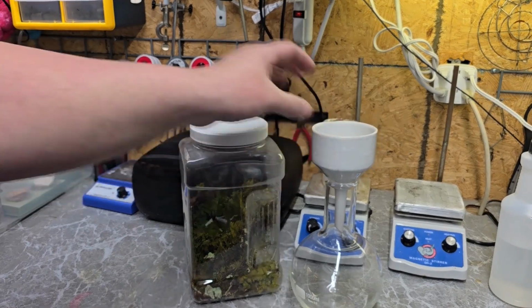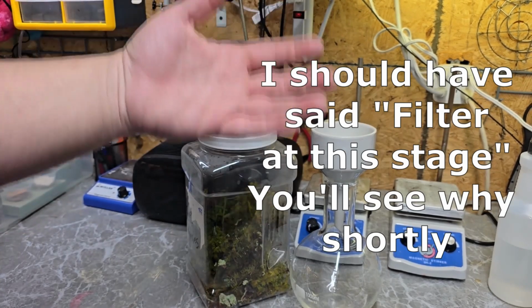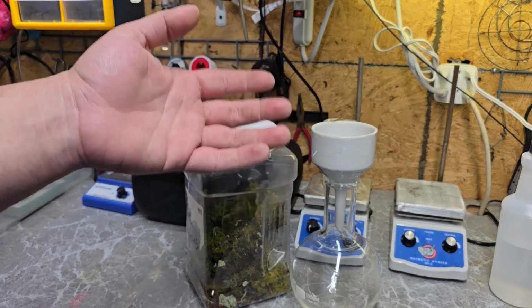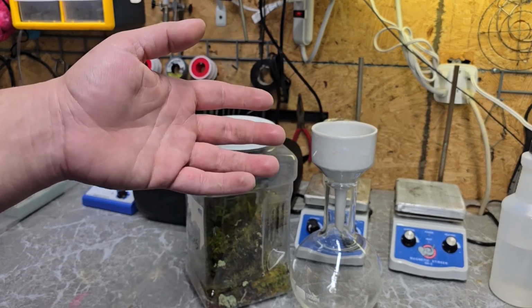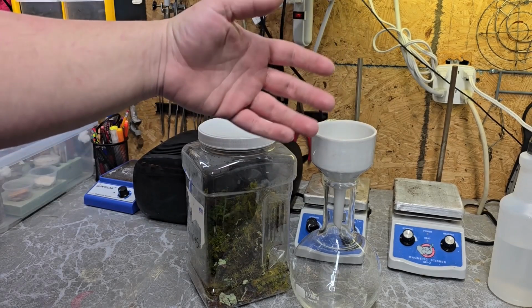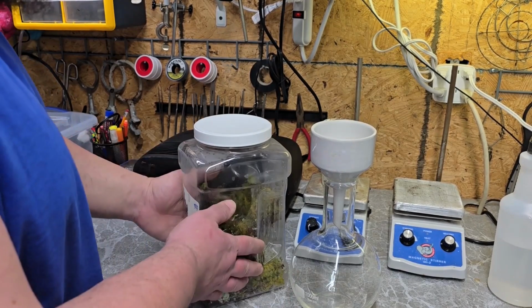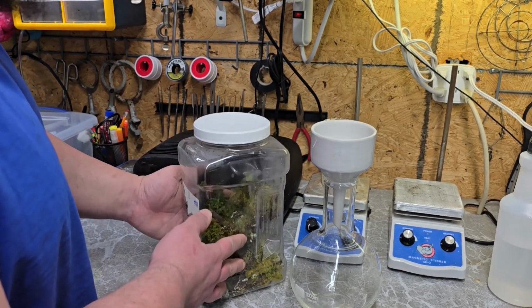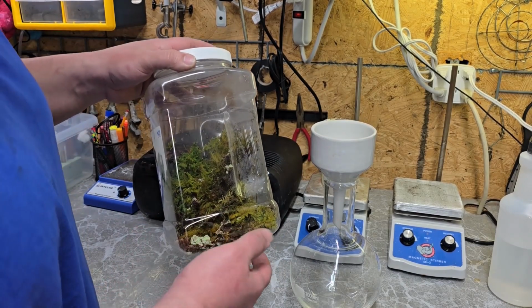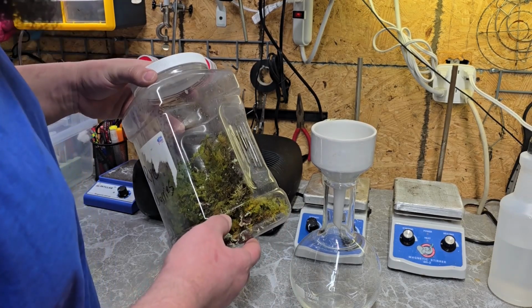can filter out at least the large chunks of moss. We obviously don't really want to filter this, because if we try to filter this with a regular filter paper, it's going to leave behind any animals, any microscopic fauna. We want the holes to be large enough for tardigrades and nematodes and whatever else is living in this moss and this lichen mixture to go through, but small enough to keep these large chunks of moss out.